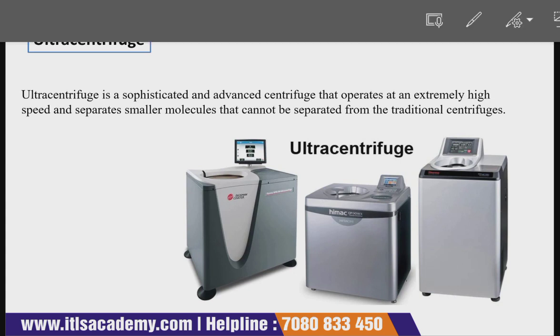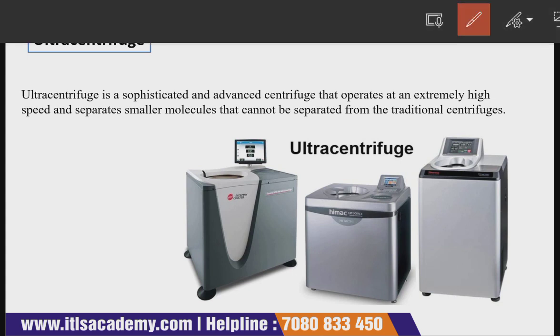Simply, it is the advanced version of a centrifuge, and it operates at an extremely high speed, and it separates those molecules that cannot be separated by the traditional centrifuge.